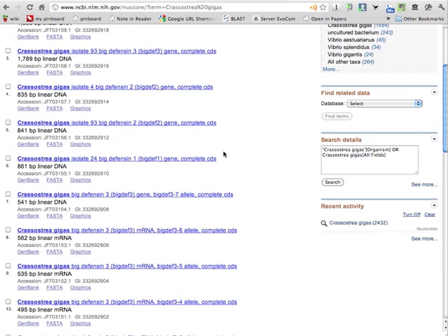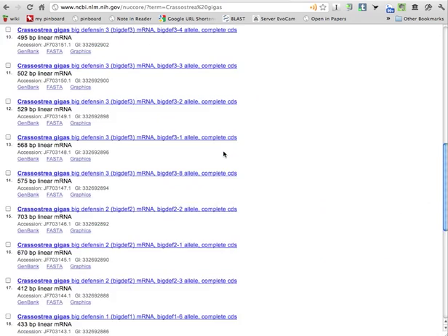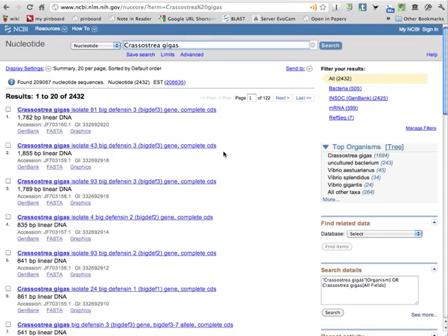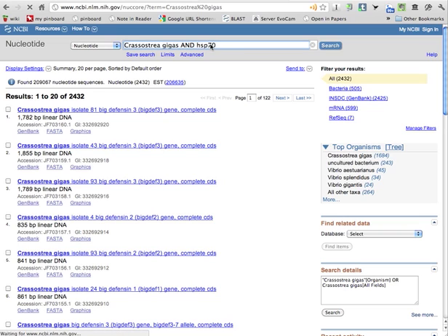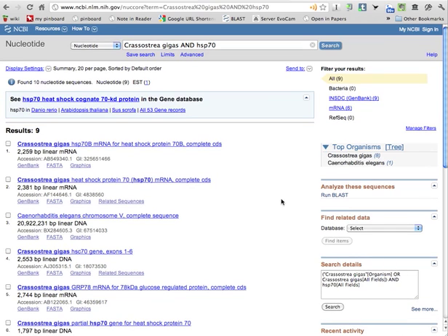All right, so you could browse these, but you don't have time, but through your research you might find certain genes you are particularly interested in. Let's just say Hsp70. You might get something like this.